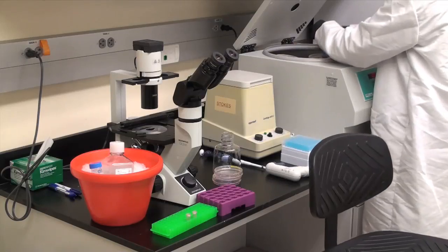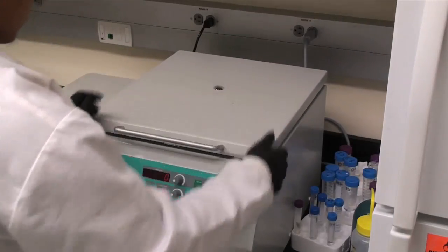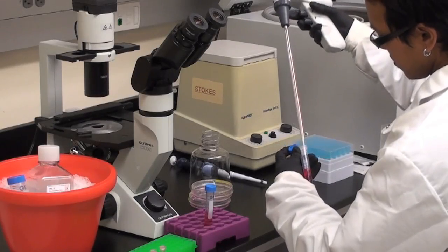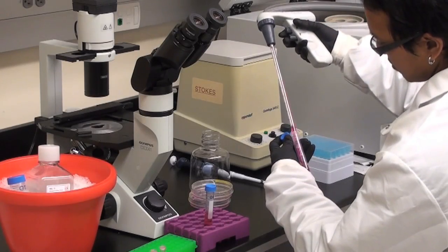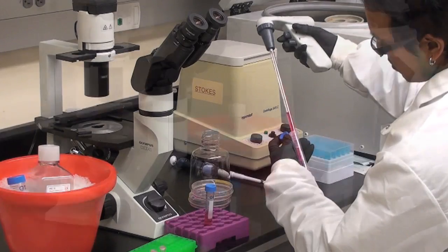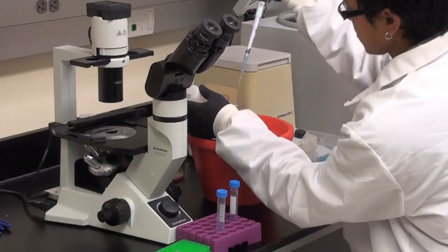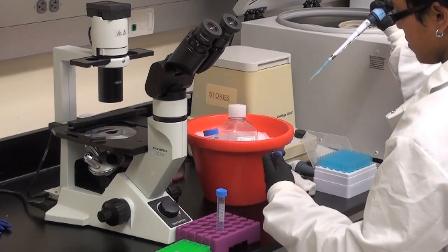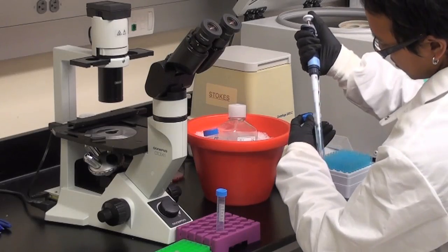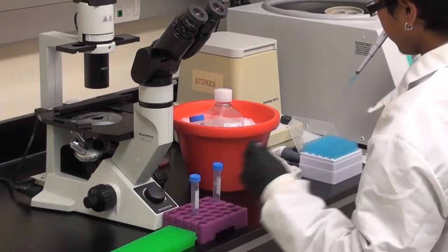Spin the tubes in the centrifuge at 1000 rpm for 5 minutes. Once centrifugation is complete, aspirate off the media, leaving the pellet at the bottom untouched. Add ice cold PBS to the pellet, pipet up and down once, and transfer it to 1.5-milliliter tubes.